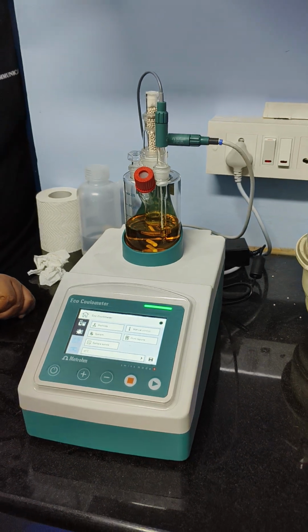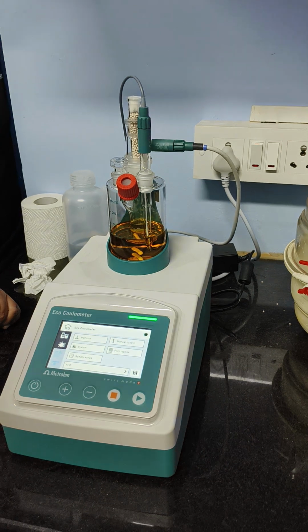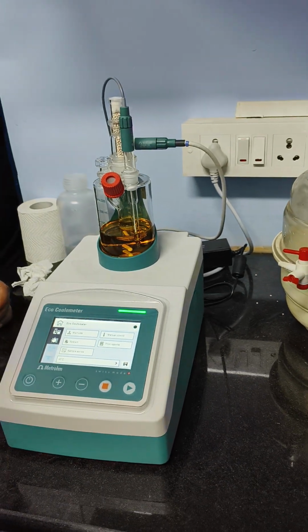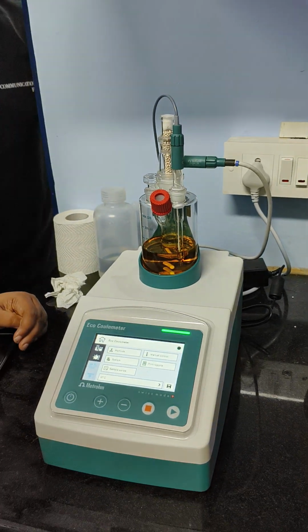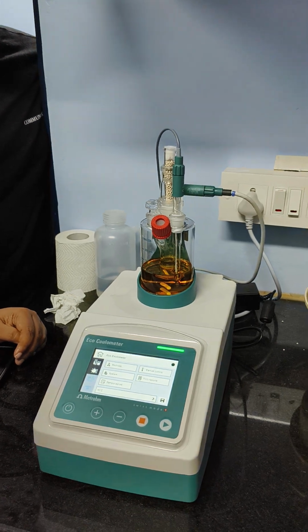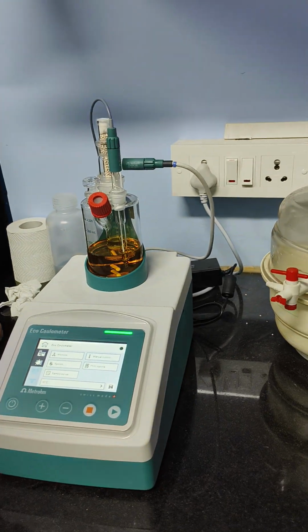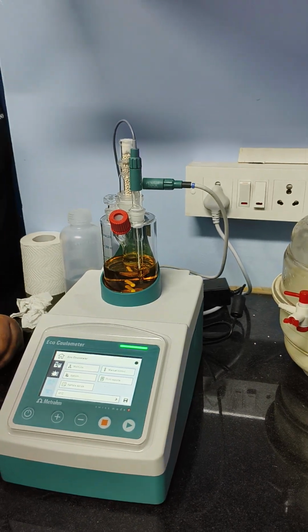Coming back to KF volumetry and KF coulometry, KF volumetry is the relative measurement and KF coulometry is the absolute measurement. Here you cannot do any standardization. You can just validate your system with a known standard and check whether it is coming as per the certified value, the COA, certificate of analysis. For coulometry, there is no standardization, you can only cross-check with the known standard.